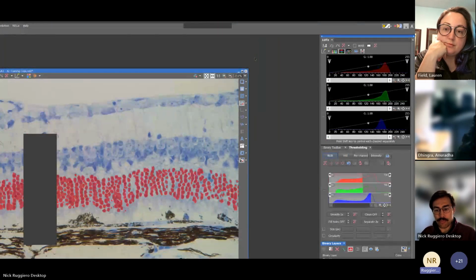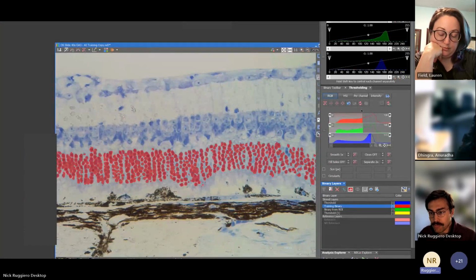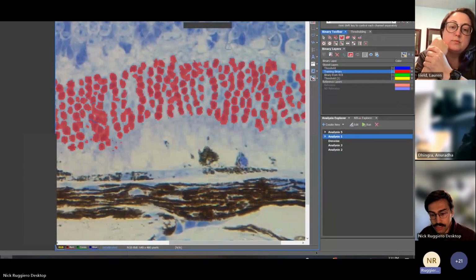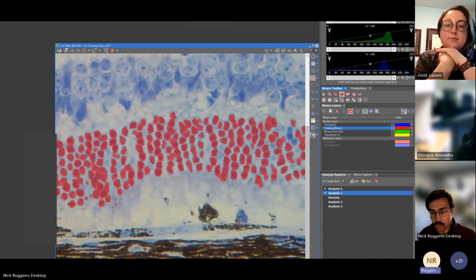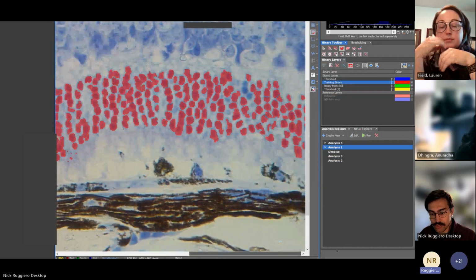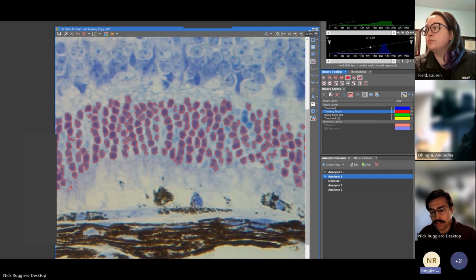From here, what I would probably do, or what I did, is I would go in with my binary toolbar. I'm going to zoom all the way in. And I'm going to start working on segmenting out each of these objects. You can see here, we have like 3 nuclei. I'll try to make this a little bit easier to see. We have these 3 nuclei here. We have a really nice tool called Separate Objects Manually. This is going to be a bit of a tedious process.